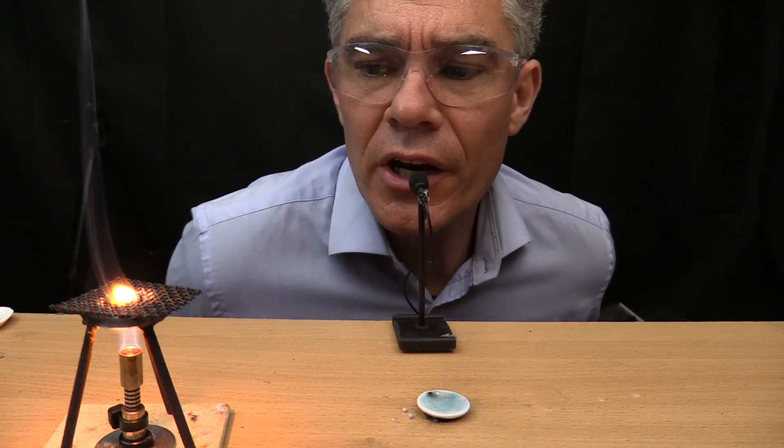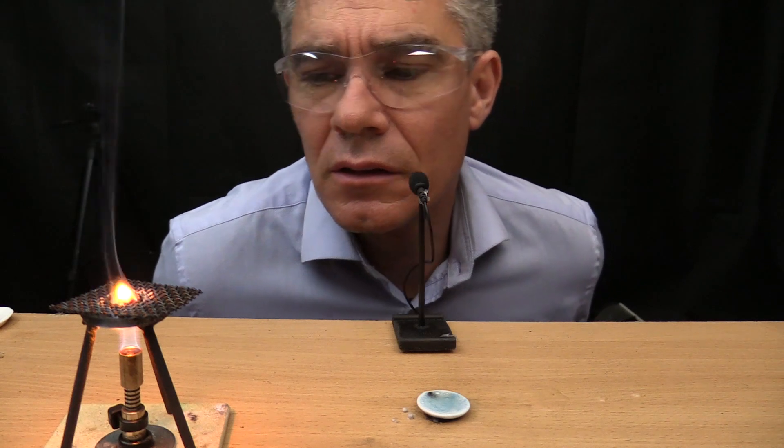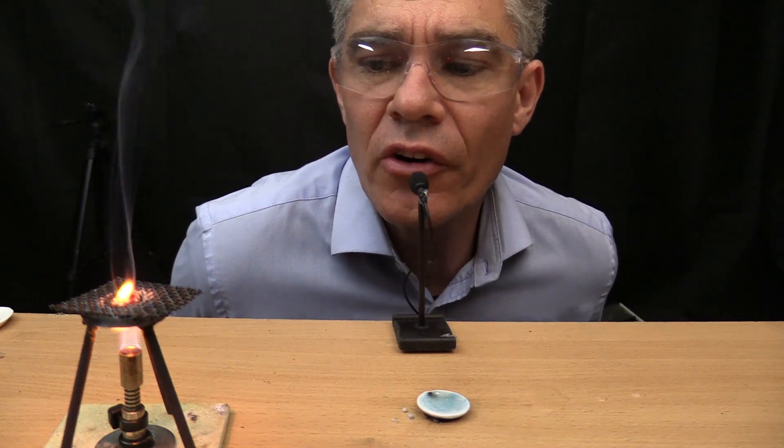It's very beautiful, isn't it? A beautiful orange glow.